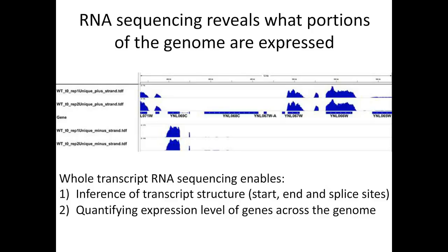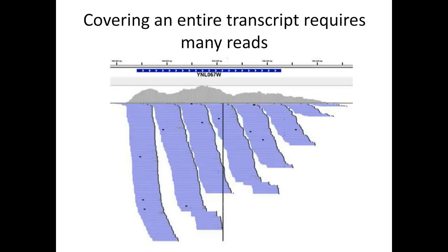Another important benefit of RNA sequencing is that it allows us to quantify the expression level of genes across the genome, so we can understand how genes are expressed and how they are regulated. But whole transcript RNA sequencing requires that many reads be assembled across the gene in order to map its structure. This allows us to understand these aspects of how the transcript is formed, but in some cases we might be interested in 3' end sequencing.